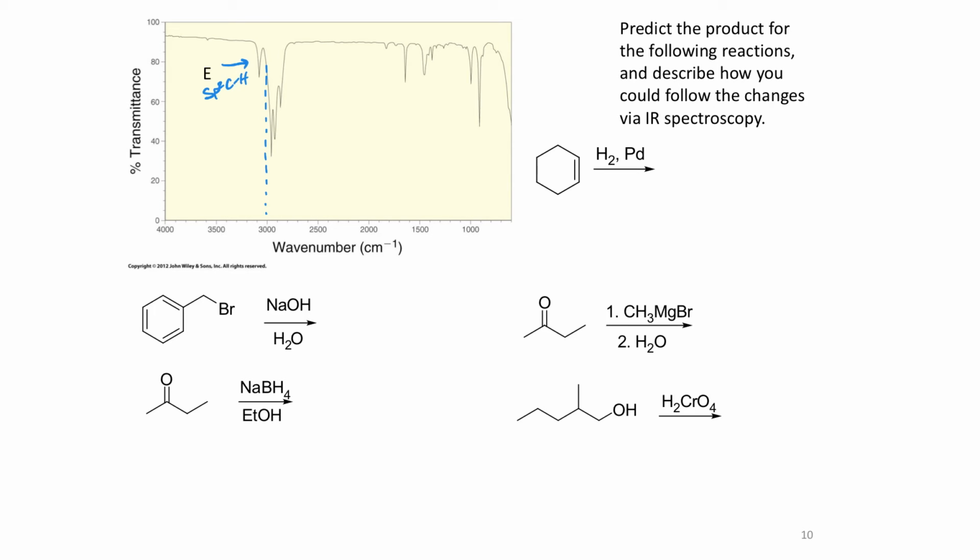So that tells me there's some sort of alkene here. Again, looking at 23 to 2100, there's nothing here. Looking at 1850 to 1600, this peak actually does appear in that region, and that is a very low intensity peak, so it's not going to have a strong change in dipole moment. So that most likely is a CC bond, and I can couple that with the information I had from the 3100 region, telling me there probably was some sp2 carbons here.